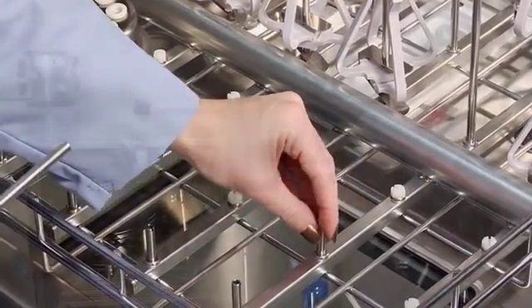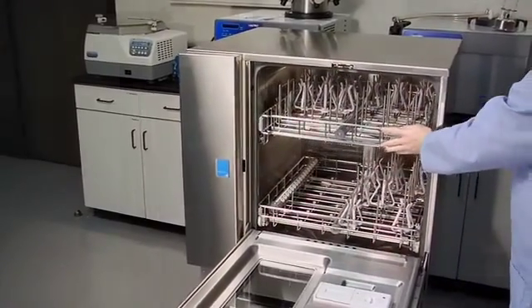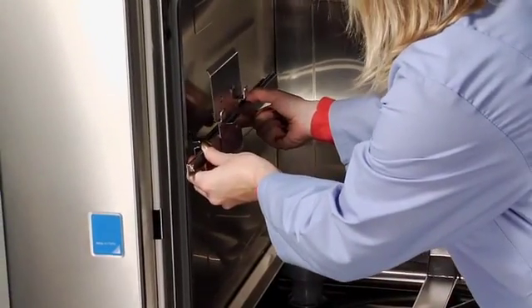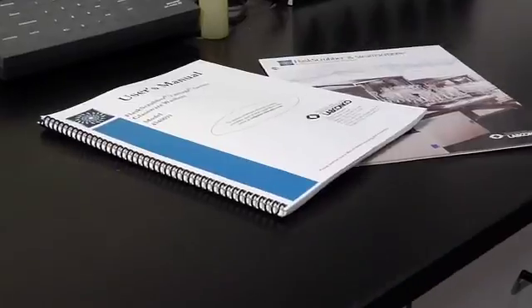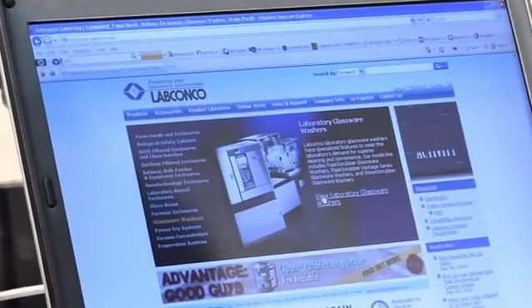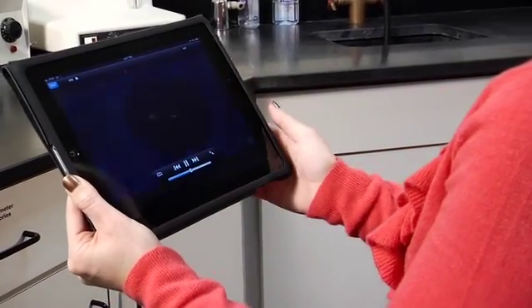The accessory upper spindle rack or standard rack expands the washer's capacity to handle additional glassware. Using the upper rack on the Flask Scrubber and Flask Scrubber Vantage series requires installation of the upper rails; consult your user's manual for installation instructions. Complete information on testing, maintenance, and troubleshooting can be found in the user's manual. A brief video on programming your LabConco washer is available on LabConco's website at labconco.com and on YouTube at youtube.com/labconcocorporation.